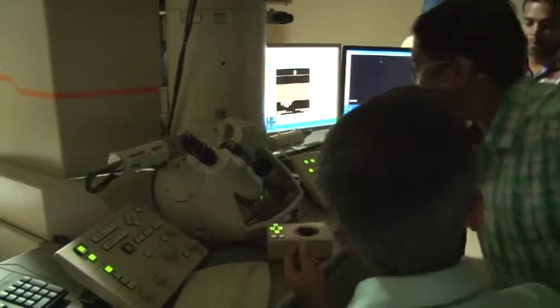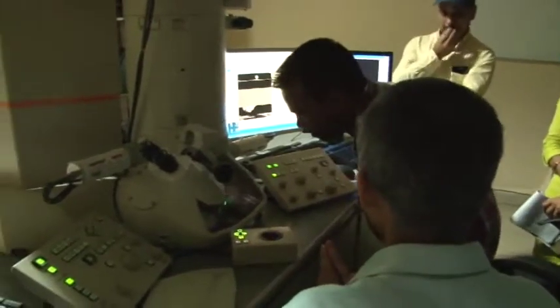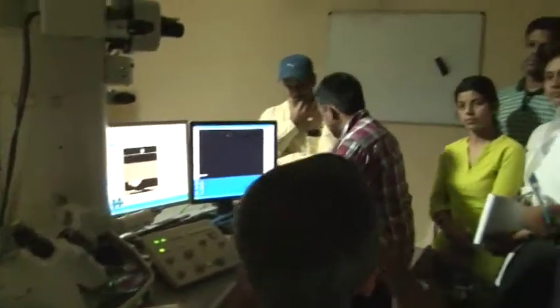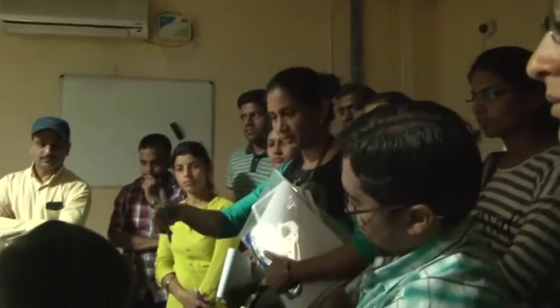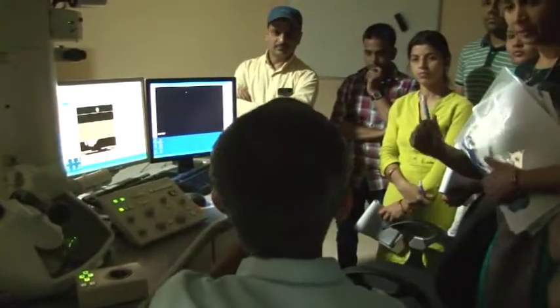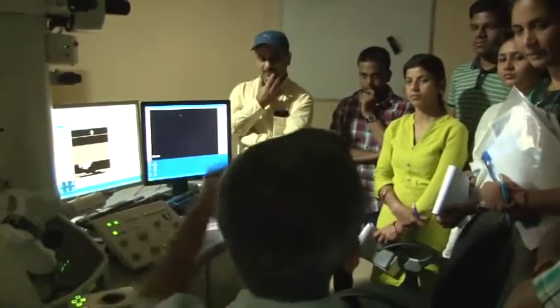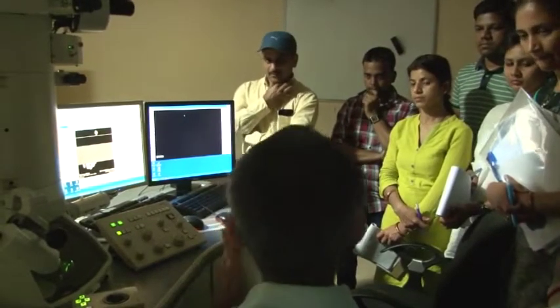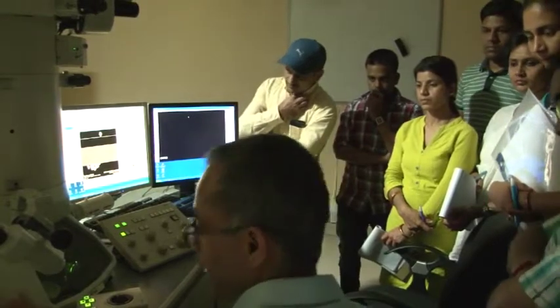Okay, so it was only 2-3 millimeters away. I centered it. Fine. This step one has to be done so many times during one's work that it is not considered as a bit. So basically the center of the column, like alignment. I mean the black part, the beam we are centering. In a way it is the optic axis. Let us assume this black hole is supposed to be the optic axis. And if the beam has slightly shifted, then you shift it back to the center.